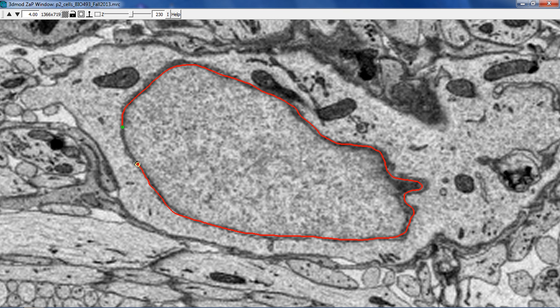Almost done. We'll get close to the end and we'll let it close for us. So I'll click off here. There we go. Use our smoothing and our reducing tools, E and R, a couple of times to remove some of the jitter from my hand.